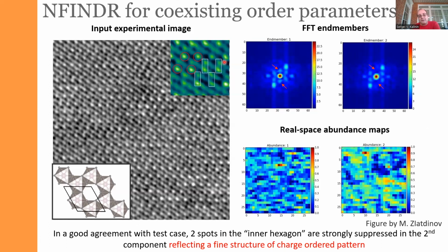So let's look at this STM image, where sort of by eye we can say that sometimes there are dimers like this, and sometimes there are structures like this. Can we use the same analysis to analyze the image when we don't have the clearly visible phase boundaries by eye? Turns out that we can. So in this case, we also can divide the image into components. And you can see that there are clearly a spatially ordered region with one phase being dominant and another phase being in the minority.